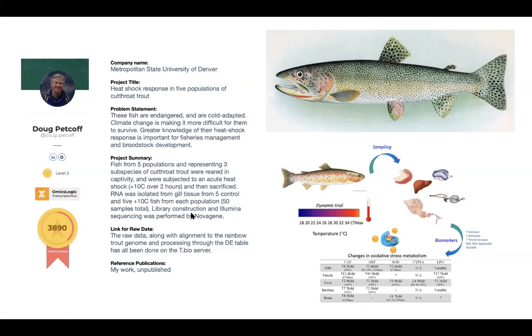And I've done a preliminary analysis. As you know, I've got the DE table on them, and I've looked through that by hand and pulled out some of the genes that caught my eye that were highly differentially regulated, a lot of heat shock proteins, not surprisingly.